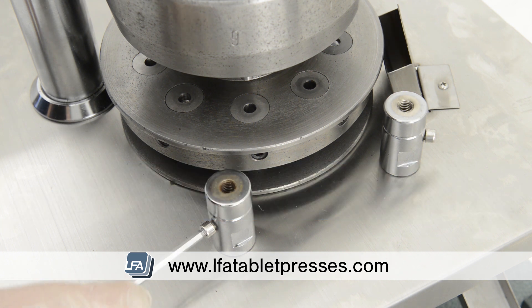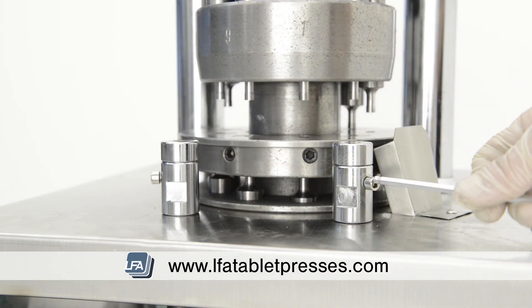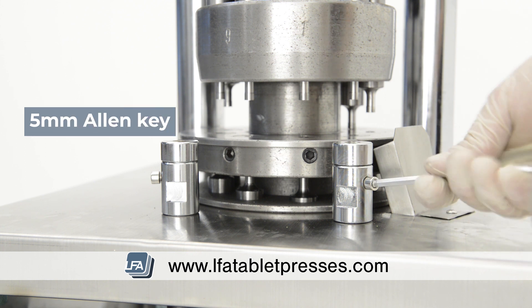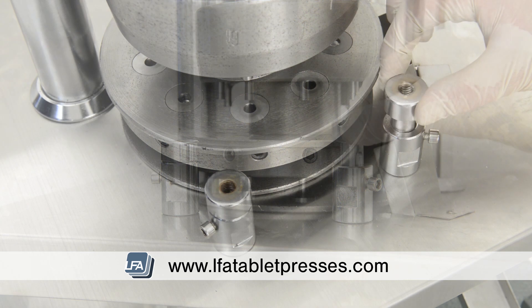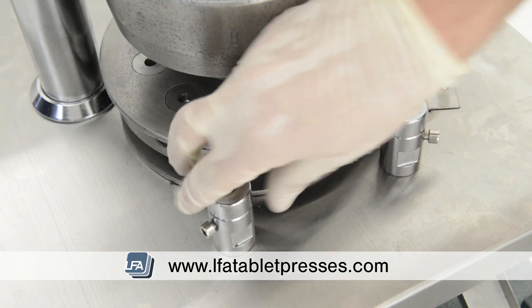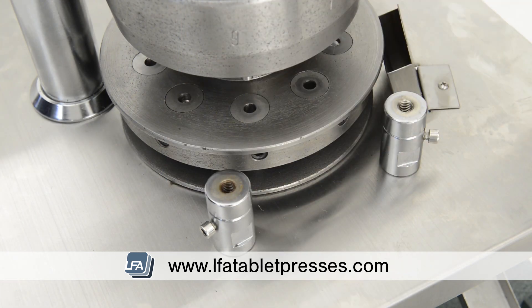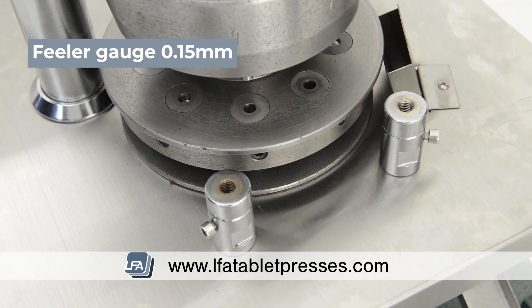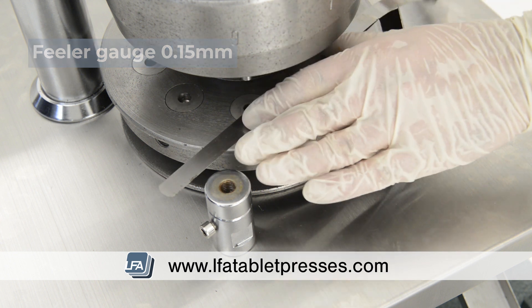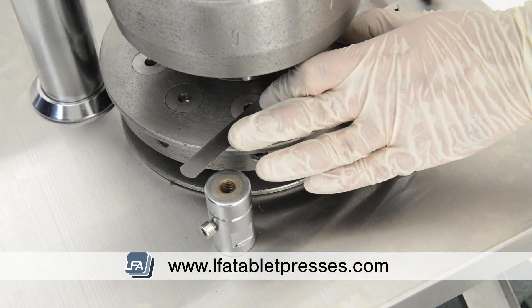Before we start, we need to loosen the bolts on the feeder tray fitting parts with a 5mm allen key so the upper part can move freely. Next, using a feeler gauge set to 0.15mm, rest it on the turret table and place the feed frame on top of it and into position.